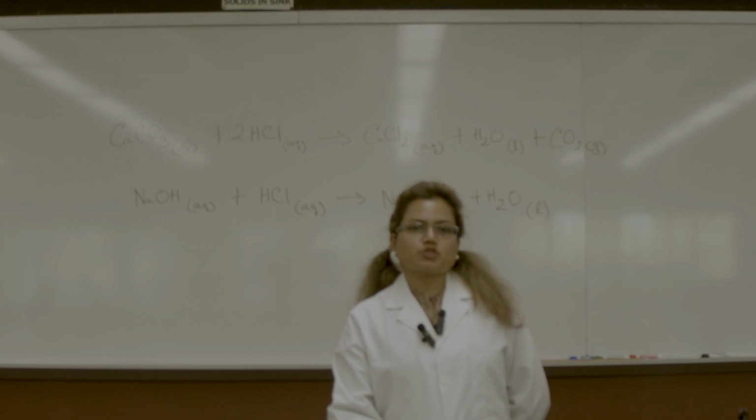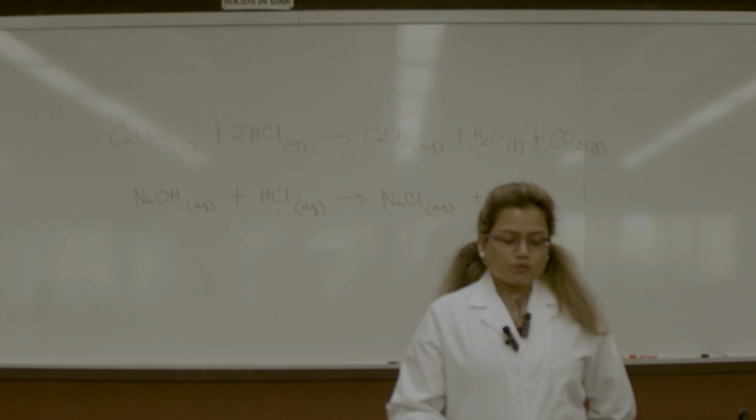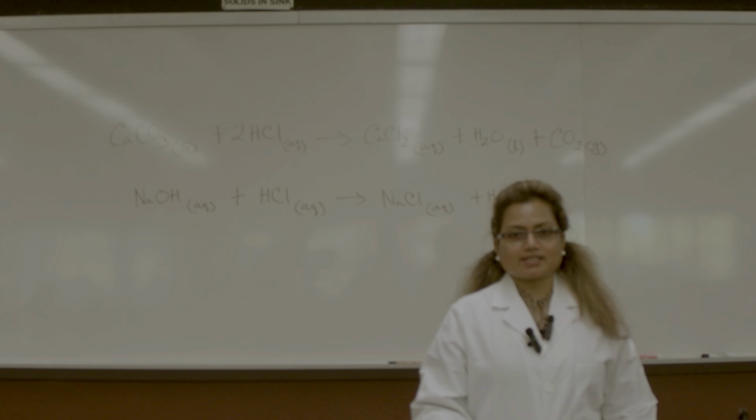Welcome again for Science 25 Lab. Today we are going to do experiment 10, which is titration of commercial antacid.